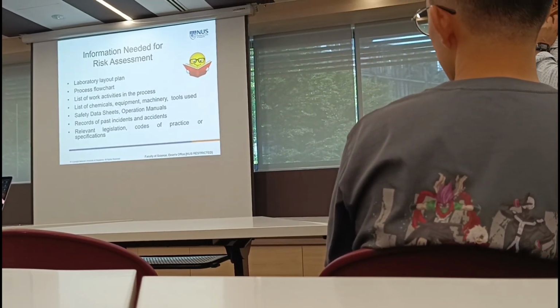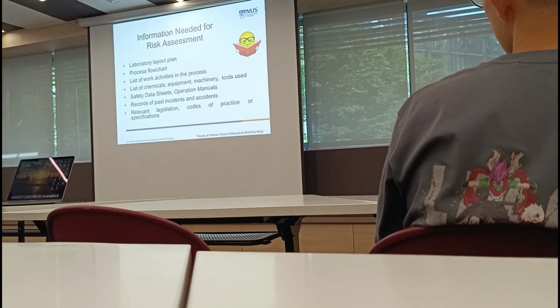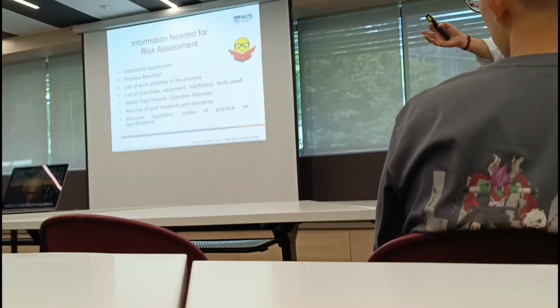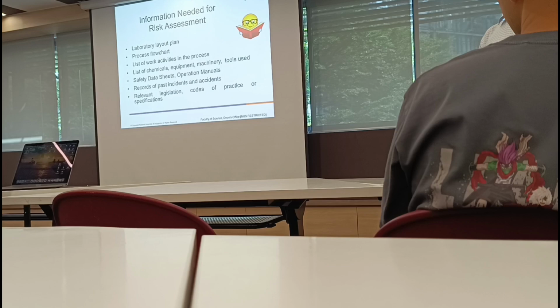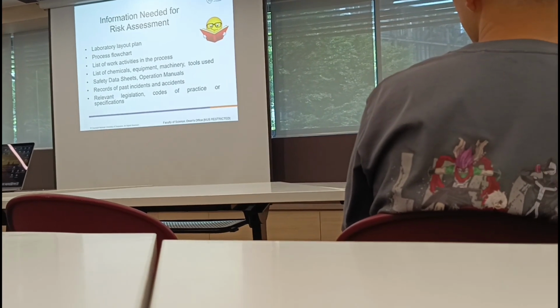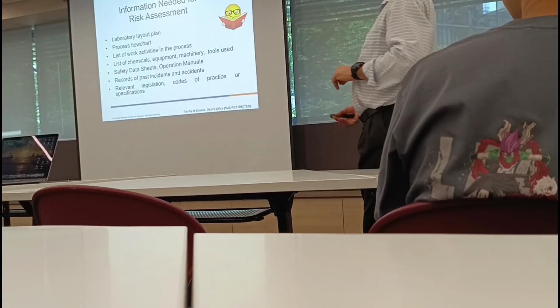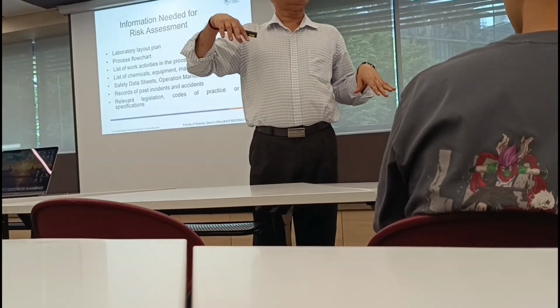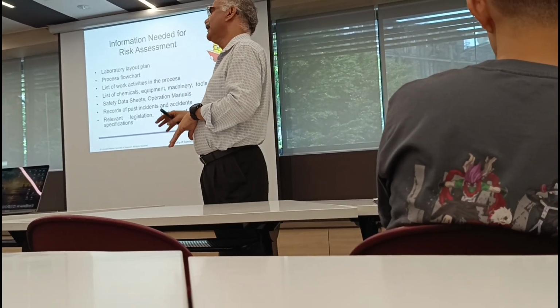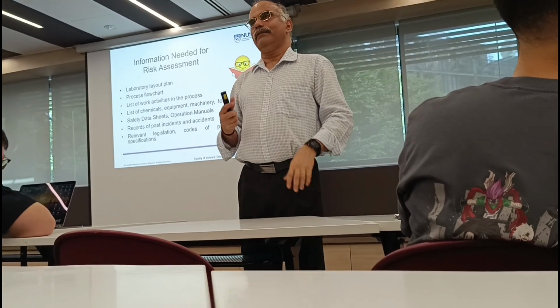Records of safety data sheets and operation manuals you must have, right? For example, the safety data sheet of all the chemicals you use. So if you want to do some sonication or something like that, you need to know how to operate that particular instrument, right? Or you need to use an ultracentrifuge, you need to know how to operate it. You need to be trained before you start that thing, right? Don't jump in and say, oh yeah, I know how to use it. I have done this in my previous institution, but some of the machines are different. They may have different capabilities, even though they are from the same company, maybe an old version versus a new version, right? So you should always get trained by a senior student in the lab.